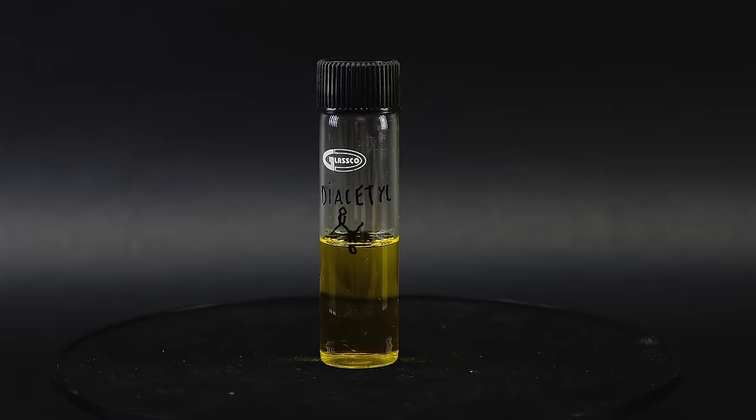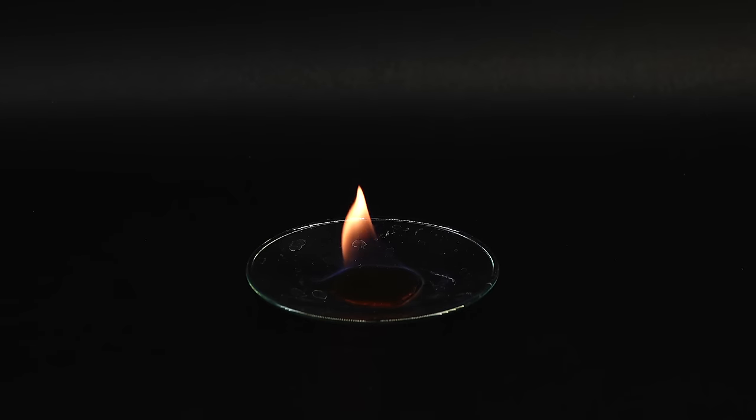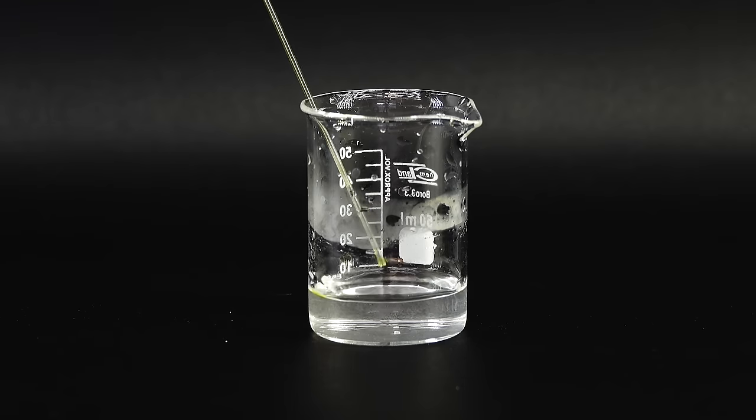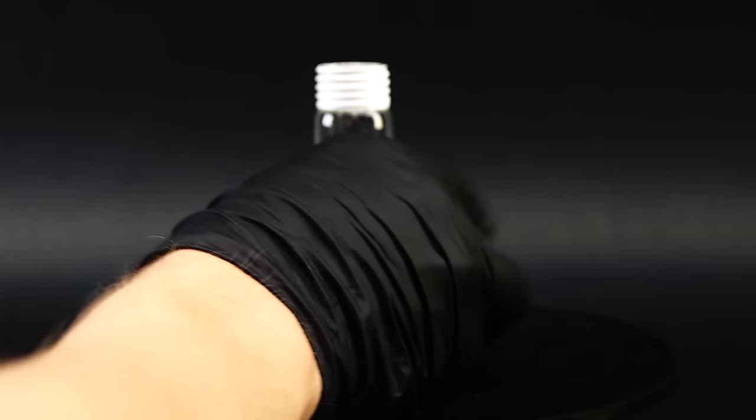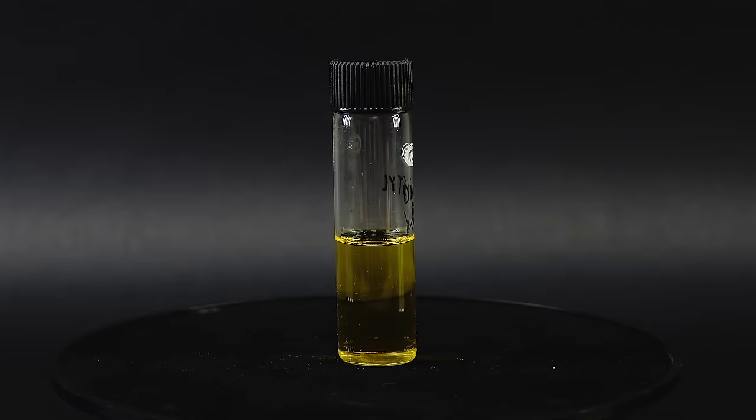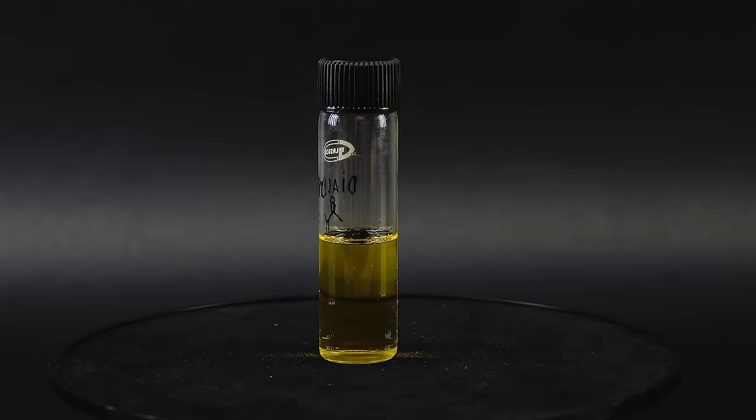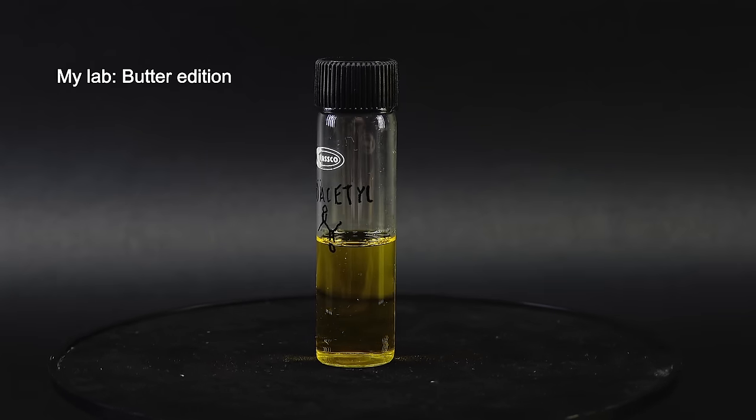Now when it comes to the properties of my diacetyl, apart from its unusual yellow color it is also rather flammable and volatile. It can also be detected by reacting it with a 20% sodium hydroxide solution which quickly turns dark brown. By far its most interesting property is its smell. It's quite difficult to describe but if you ever had some artificially flavored popcorn it smells almost exactly the same. Our noses are also quite sensitive to it since a tiny amount can make a whole room smell like artificial butter for days, and after this project my lab is just saturated with it.